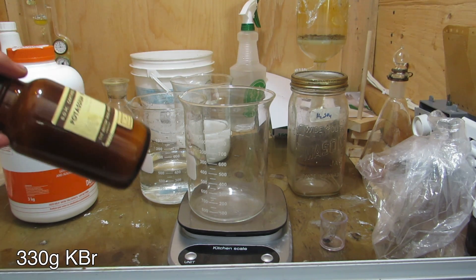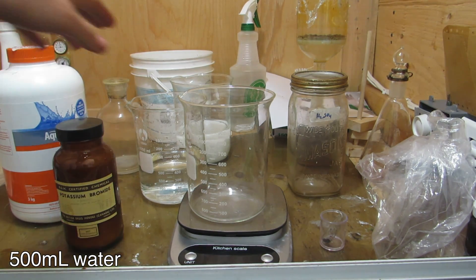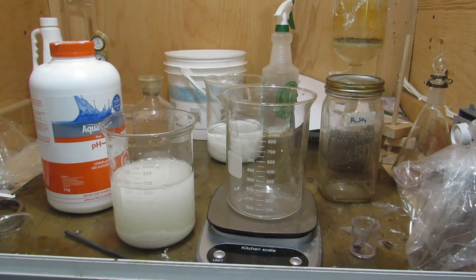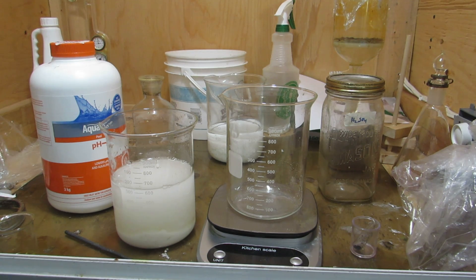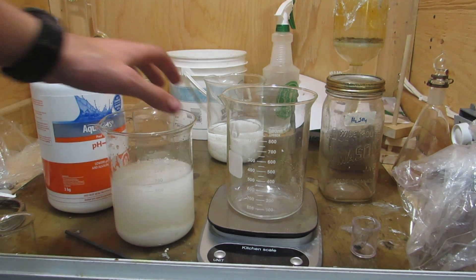To begin, we can measure out 330 grams of potassium bromide and dissolve it in 500 milliliters of water. I have some solid potassium bromide that was given to me, but you can also find potassium bromide dissolved in solution as a pool chemical at some hardware stores.